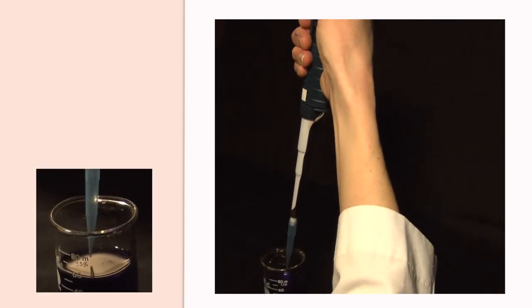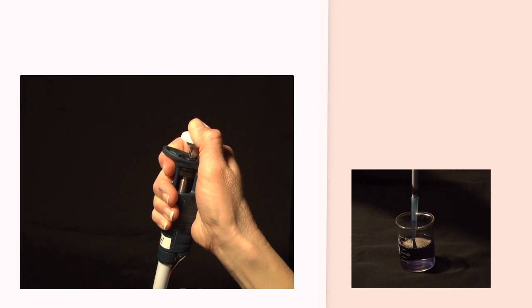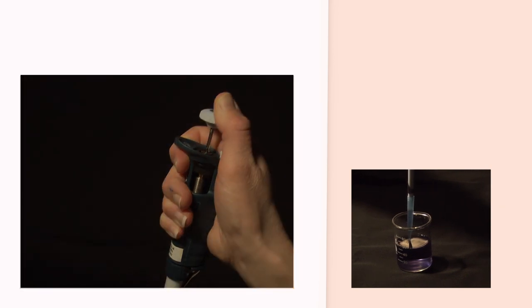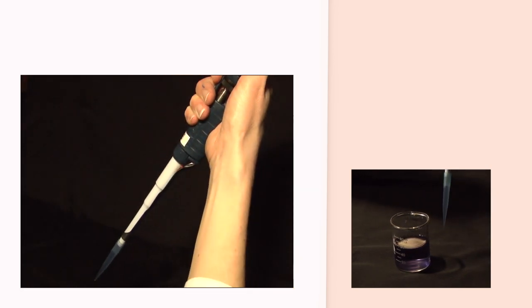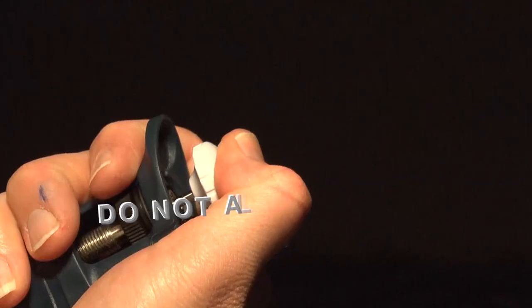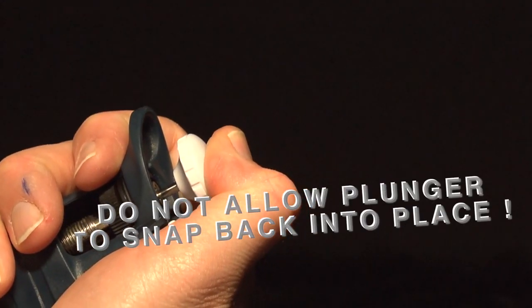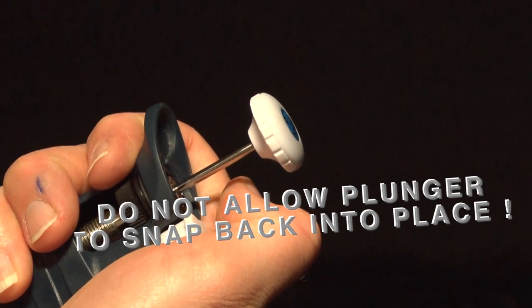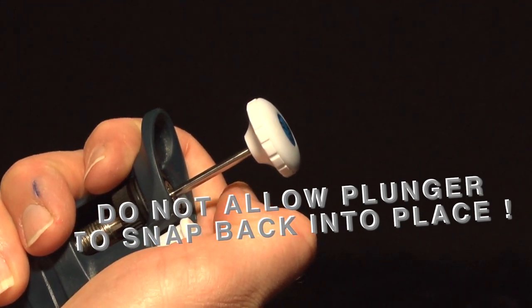Put the tip below the surface of the liquid and gently draw the liquid into the tip. Do not let the plunger snap back into place, as this will not allow for accurate volume withdrawal and may even introduce contamination into the barrel.